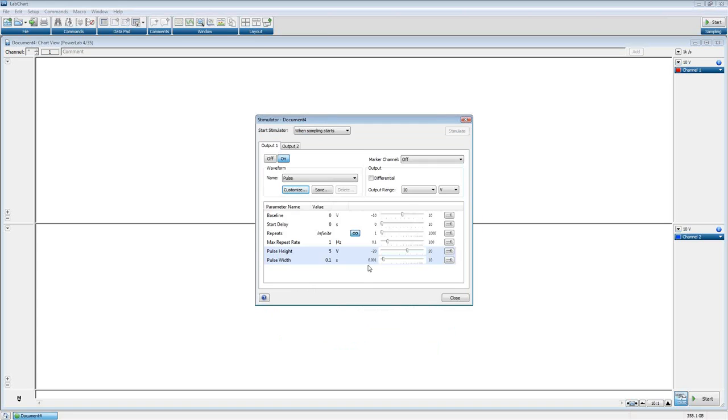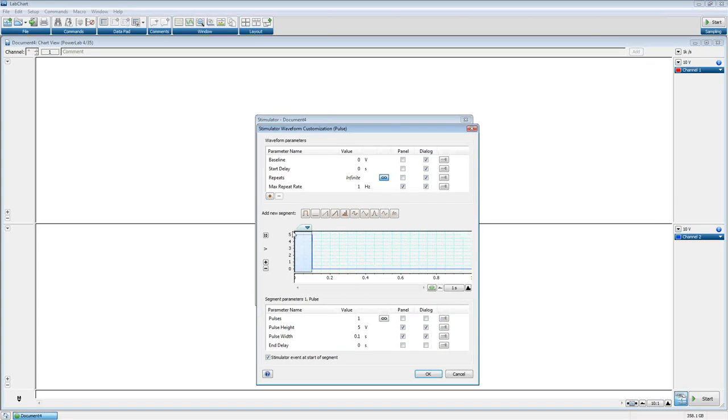Of course, you wouldn't have to go in here to the customization. You could just do that out here in the general settings, but sometimes it's easier to see the segment in this view and actually kind of see what you're changing and doing. You could also add multiple segments like this if you want to do specific things with amplitude in that train. I hope this is answering your question here. If not, definitely put something into the questions again here, or we can talk about it later offline.